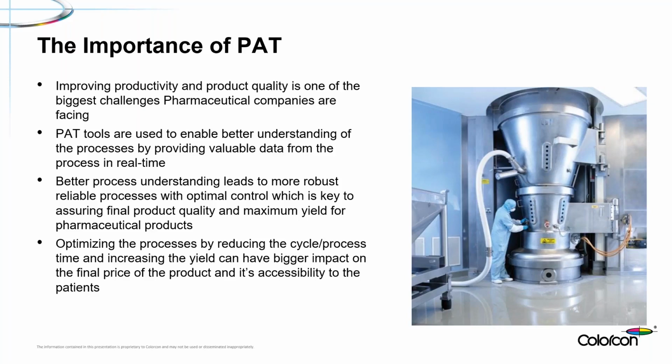And the traditional view is to characterize your incoming raw material critical quality attributes, and then provided they fall within a certain acceptable range, traditionally, perhaps we run our process as per its standard definition. But a lot of this comes from the lack of tools to measure these attributes in real time in processing.